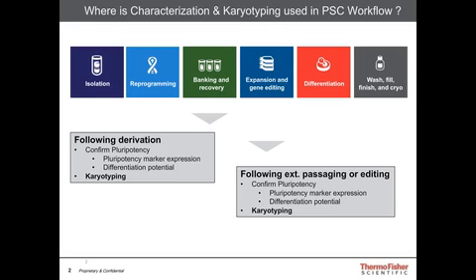While characterizing stem cells and their derivatives, along with maintaining pluripotency and differentiation potential, it is also critical to confirm that the cell line has not acquired any genomic abnormalities following derivation, extended passaging, or genetic manipulation. In addition to that, it is important to uniquely ID every parental and subsequent derivative cell line, especially useful for core facilities, stem cell banks, or clinically relevant cell lines that require a high level of traceability.